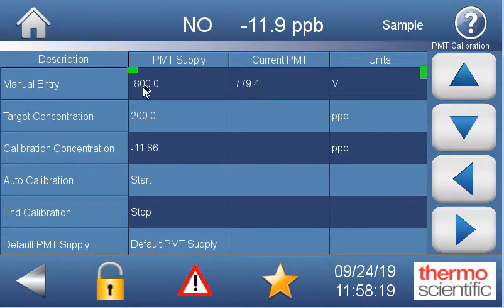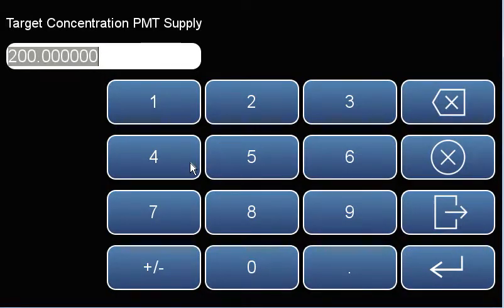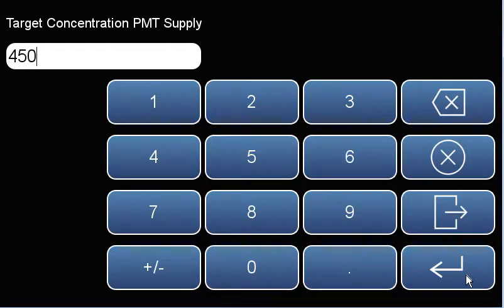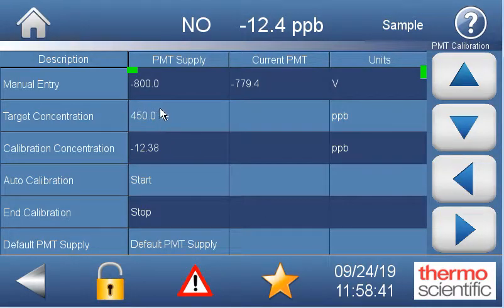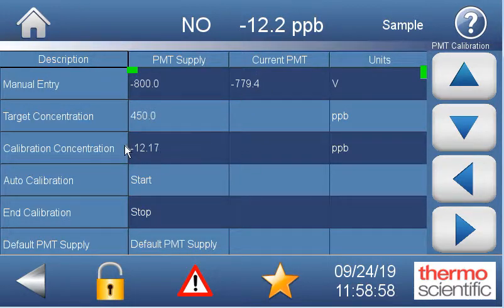In this screen we've got our current PMT up here. This target concentration is the concentration of our gas bottle or our dilution — whatever the span concentration is right now. So let's say that was 450 parts per billion, which is what we're using for units right now. We put in what our gas cylinder reads and what we know the instrument to be measuring. The calibration concentration shown is the NO, the current NO reading, the zero-corrected NO reading. When I hit the start button, the instrument is going to move the PMT up and down until this calibration concentration equals the target concentration. That's how we do our PMT adjustment.